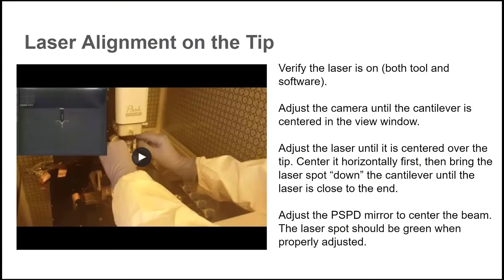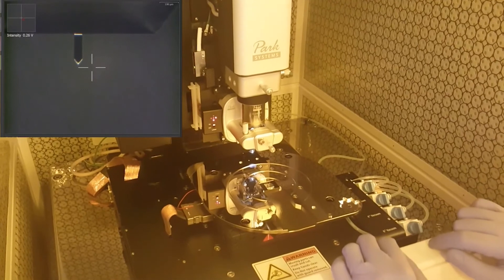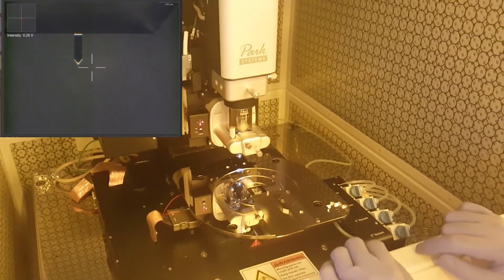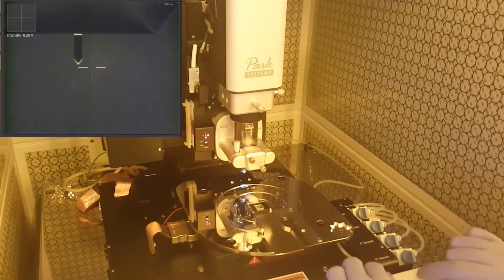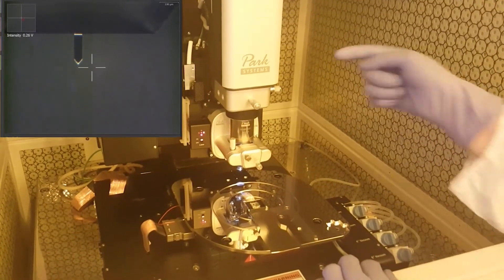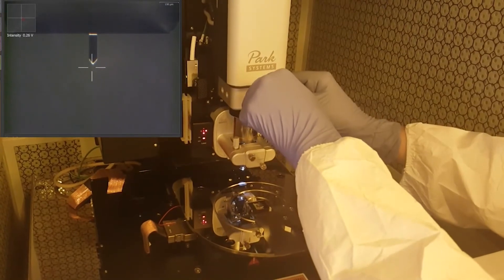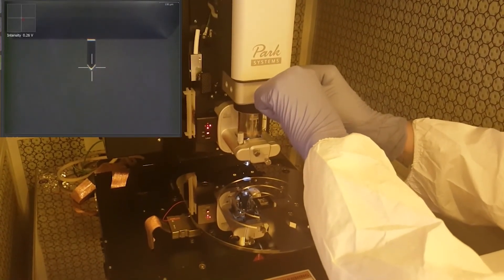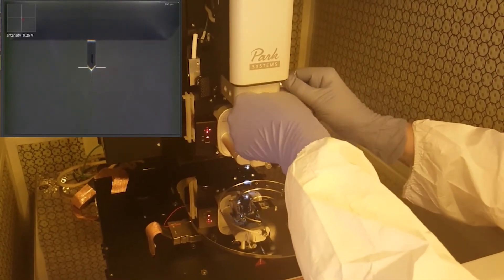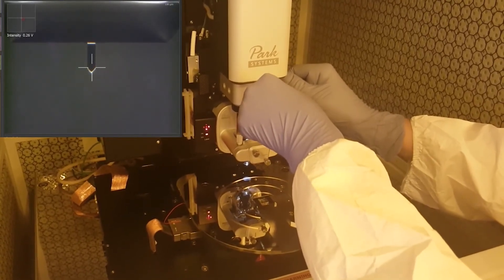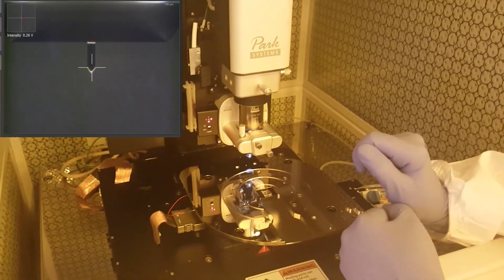To align the laser, there are three sets of adjustment knobs to use, and you'll move from the top set down. First, verify the laser is on. Then adjust the camera so the cantilever is centered. Adjust the laser so that it is correctly aligned, and adjust the PSPD to center the beam in the detector. The first thing to do is get the end of the cantilever centered in the camera view using the two camera knobs, with the end centered in the white guides. Note that on PPP NCHR tips, the tip is not at the very end — it's a little further back, where the triangle part of the narrow cantilever ends.